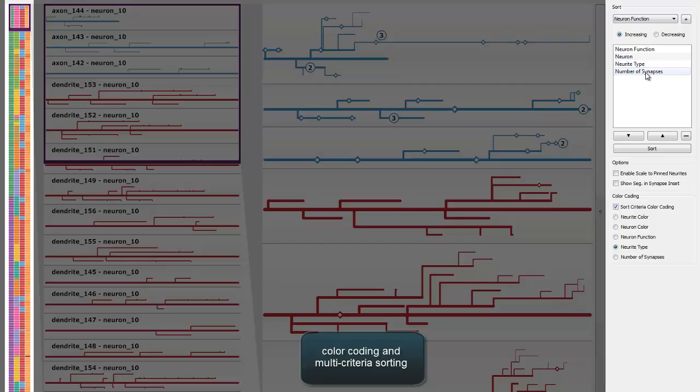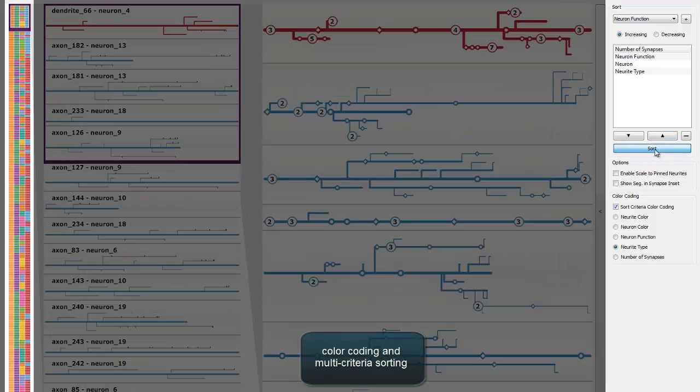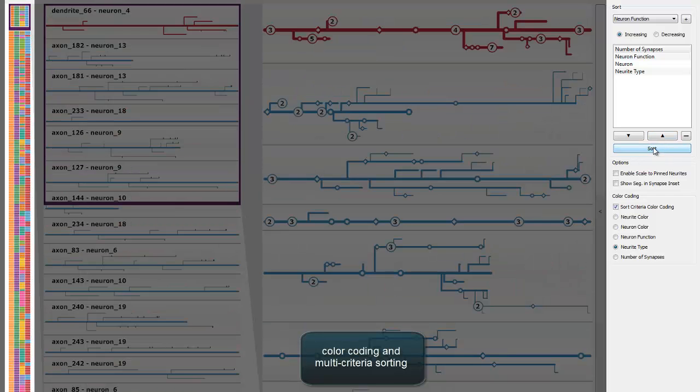Additionally, this view allows sorting according to multiple criteria. Here, the user changes the sorting direction of four parameters, which is reflected in the navigation bar.